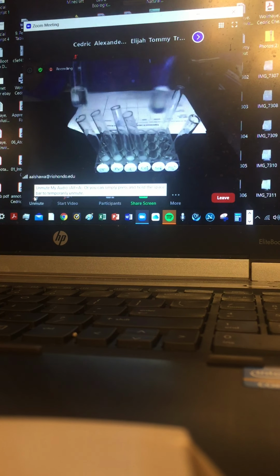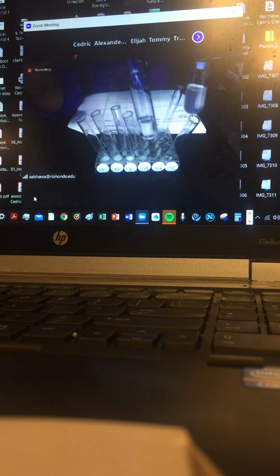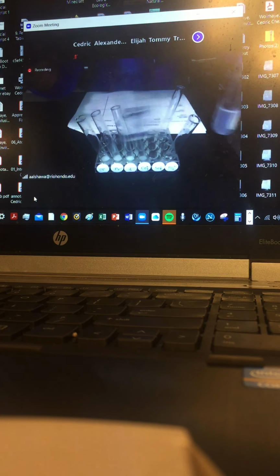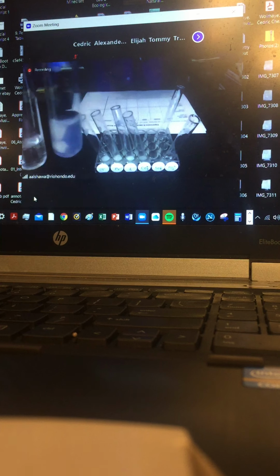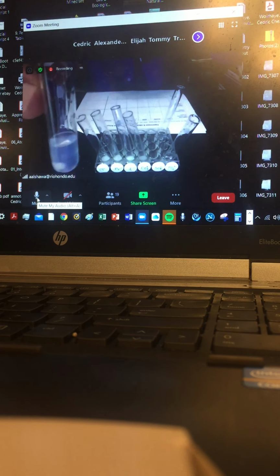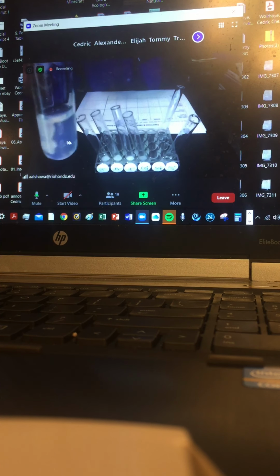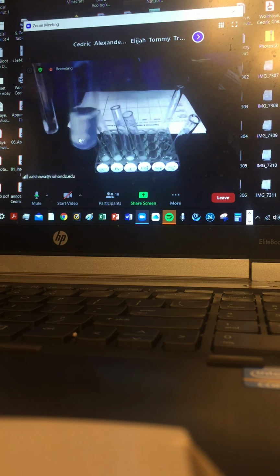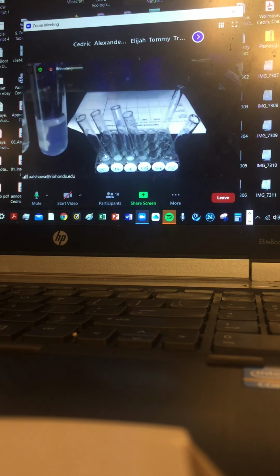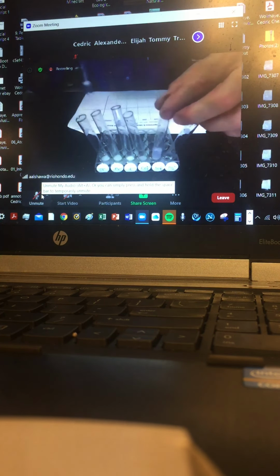Okay, so this one is 100% the same as the water. But someone said there's an ion, can't tell. So can you tell them apart? So this is upon the addition of silver nitrate to the sulfate. Oh yeah, with the sulfate you can see a slightly cloudy mixture, but it is less so than all the other four. Right. So this is the comparison.